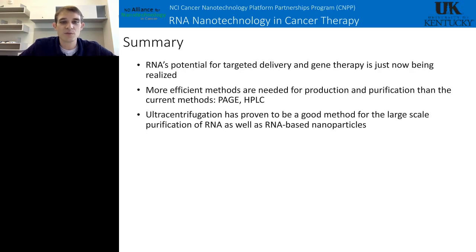So just in summary, I've talked to you guys about why I think RNA is great and why we need these different methods for the large-scale production of not only single-stranded RNA, but also the RNA oligomers. And I hope I've convinced you that this ultracentrifugation method can be used as a better alternative to PAGE or HPLC.